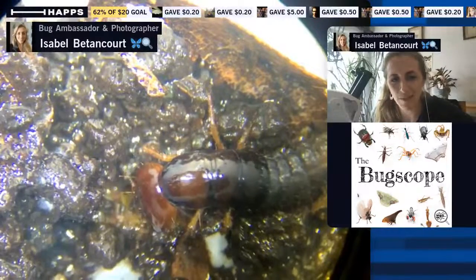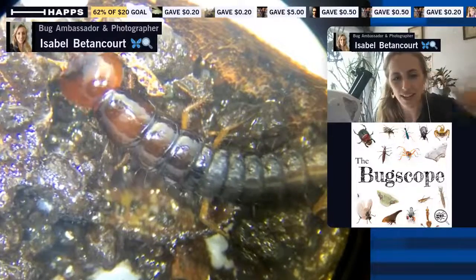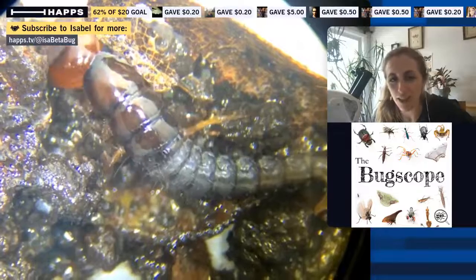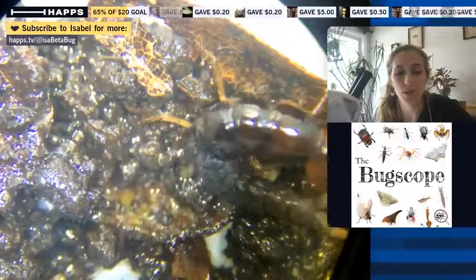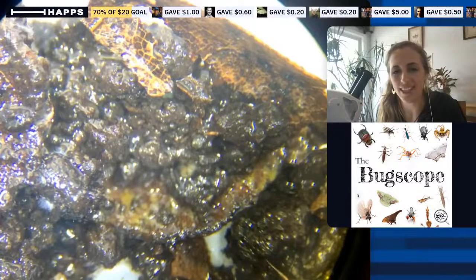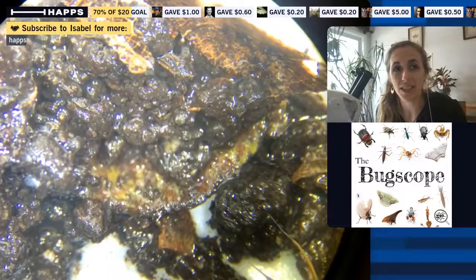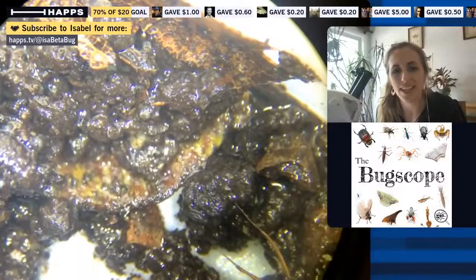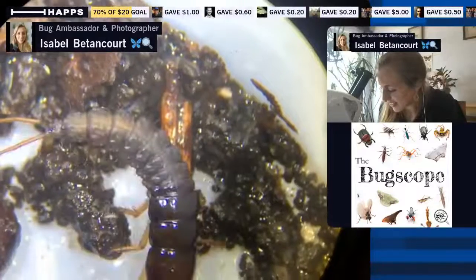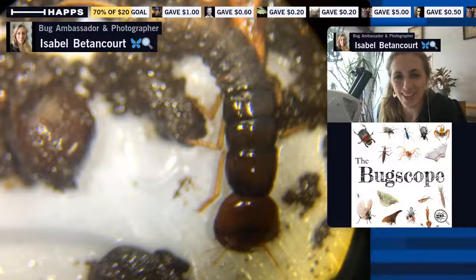Just like butterflies and moths, beetles go through complete metamorphosis. Hi Wesley, good to see you. They go through egg, larval, pupal, and adult stages. For beetles, their larval forms are really diverse. Some look like the typical grub — white and curled, very soft, with a hard head capsule — that you often find underneath rocks, holding onto vegetation and sucking on the roots of plants. Those are sometimes seen as not very beneficial. Our little guy's running away, so I'll bring them back into focus. It does like to be hidden underneath leaf litter — I found it on one of the back steps when I was clearing the leaf litter away.